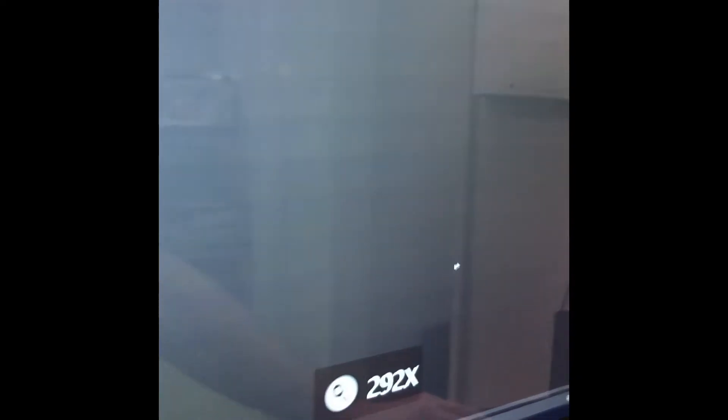The software will then finish loading. And you'll get a default image of whatever was the last thing that was saved.